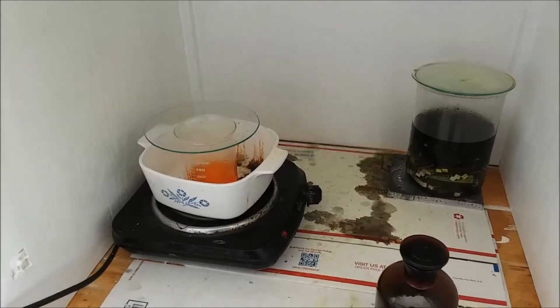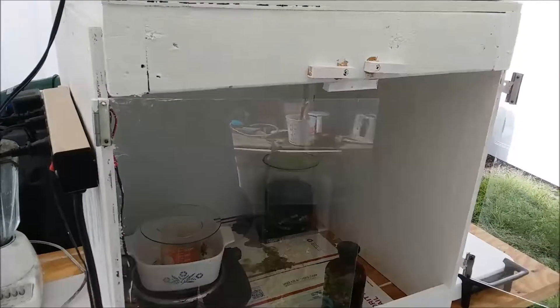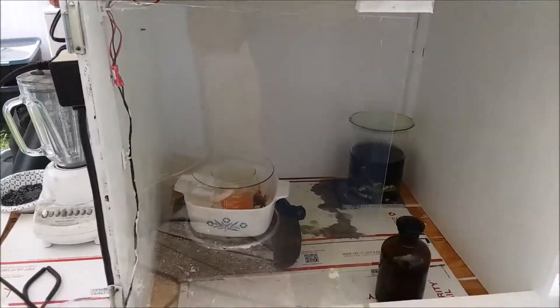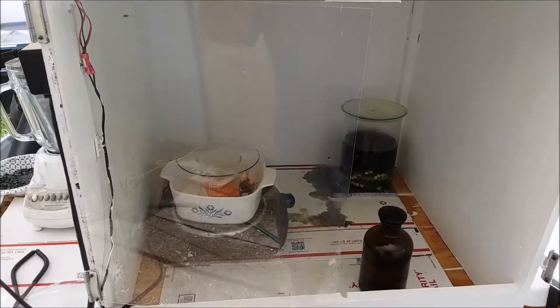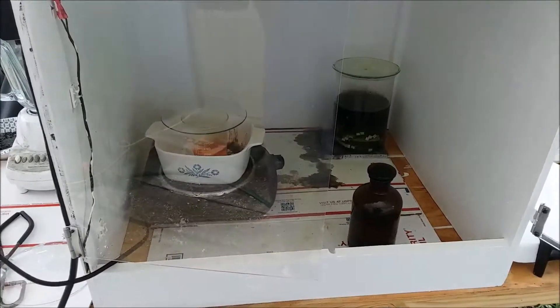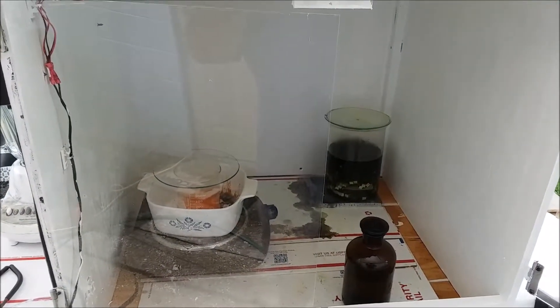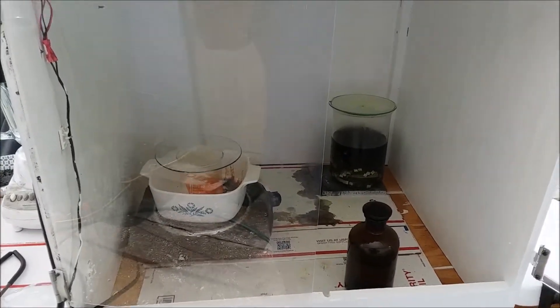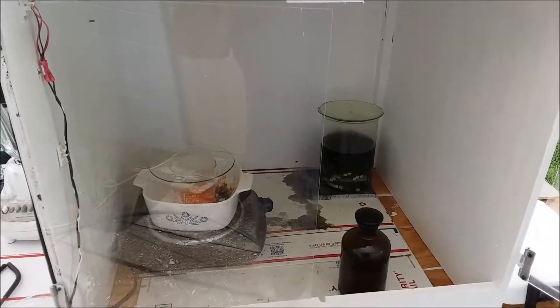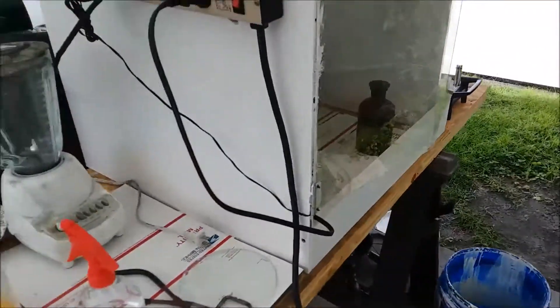I don't know what I'm going to do about the condensation problem — it'll probably rot out the metal fan pretty quickly too. Maybe what I should have done, and what I could still do, is mount the fan on either the side or on the back. That way condensation wouldn't run into the box the way it does when it's mounted on top. I could relocate the fan, put a hole in the housing so condensation runs to the outside, and have something to catch it. On the whole though, I'm very happy with it — it works quite well.